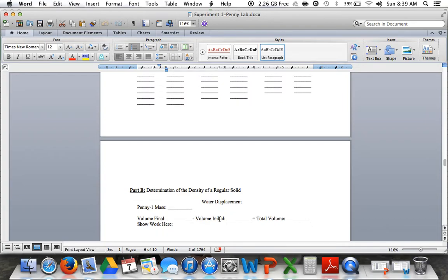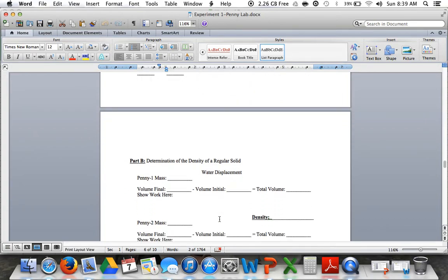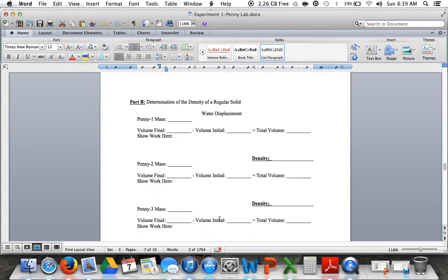You can talk about what the group is going to do. Each of you can do a water displacement experiment and a meter stick experiment, and then help out with weighing. If you all rotate like in a big circle, you'll get done and it won't be hard. If one person is doing all the work, you will not be able to finish the lab. And like I said before, if you don't finish the lab, you just miss points on everything that you didn't finish.